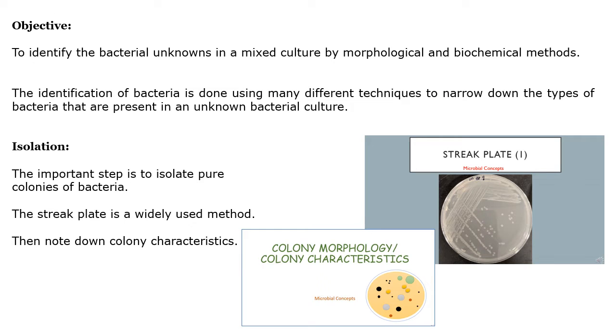Our objective here is to identify an unknown bacterial culture, say from a mixed culture, or one you got in isolation from a particular sample.